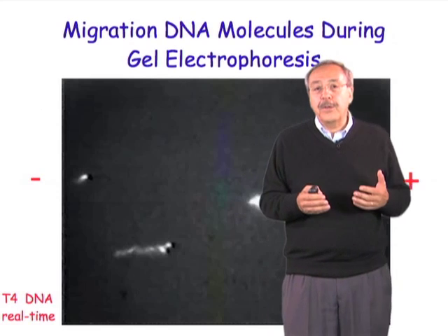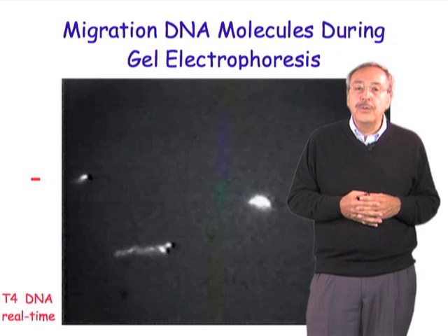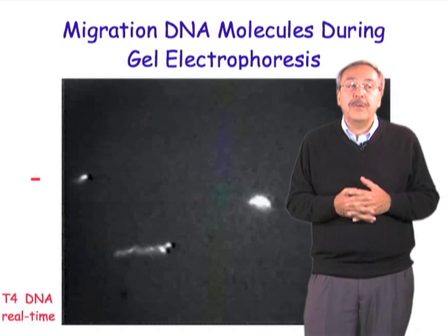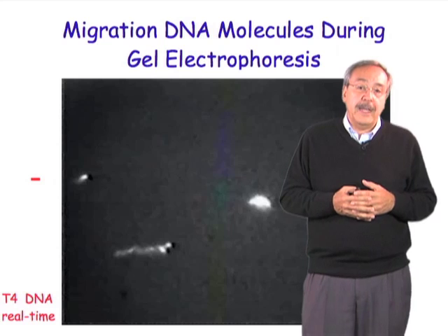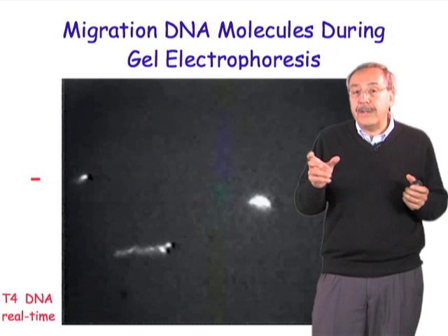As you know, electrophoresis is a very powerful technique that biochemists constantly use to separate molecules of different size, molecules of DNA of different size, or molecules of protein of different size. In this particular case, we wanted to know how it is really that molecules of DNA separate by size.